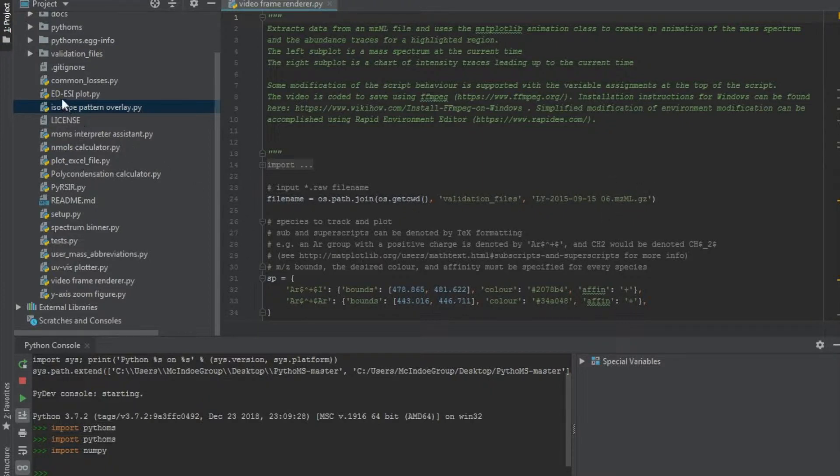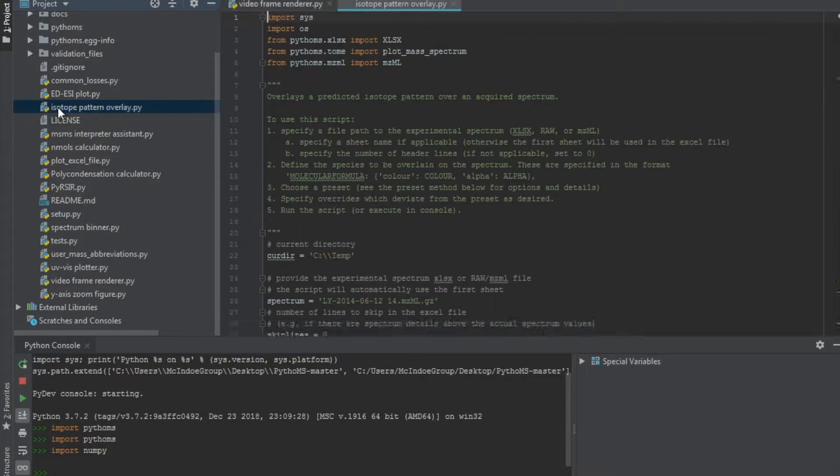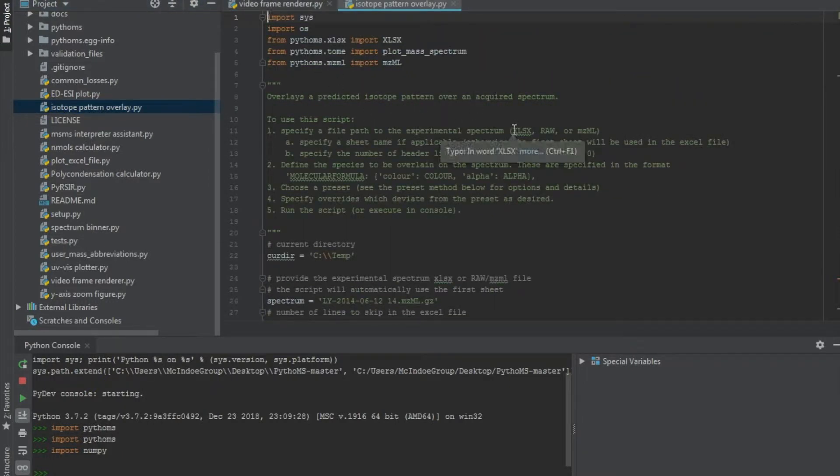Typically, the mzml is a format that can be run in all Pythoms scripts. It will be convenient to have this file on hand.